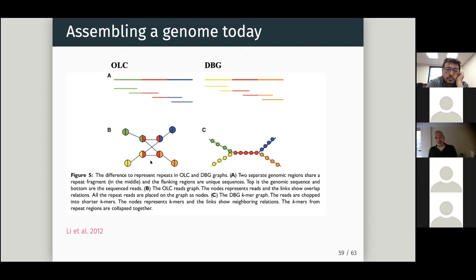And what you can see here is that then you start to build the connections between the reads, and this is an unresolved repeat. So this is a region where the assembler, the algorithm that comes later and looks into the graph and decides which path to take, is not able to walk through because it doesn't know if it comes in this way, whether it should go out this way or this way or this way. Okay, that's a big problem of genome assembly. That's the whole problem of genome assembly. There is no connective evidence that allows us to walk through the repetitive element.